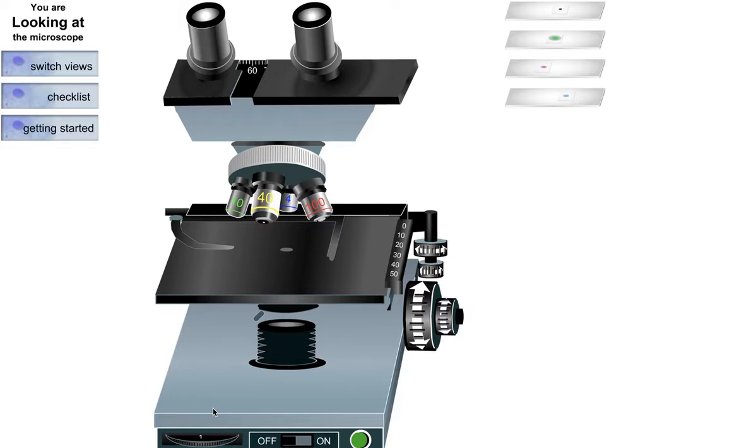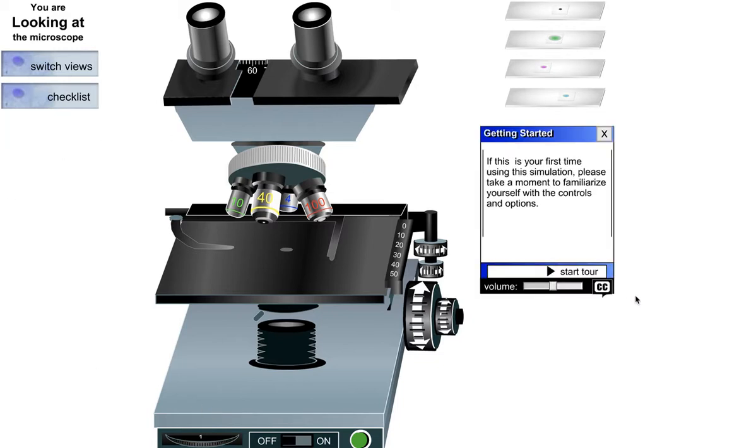Oh, hi, Christopher. I thought I would show you a video because it's actually a little more advanced than it was before, which is really good because it really does simulate what working with a microscope would be like. So first thing, if you did the animation, you probably already heard all that. Welcome. Click here for a tour. And this is a nice place if you have any questions too. And like if you're stuck at a certain place.